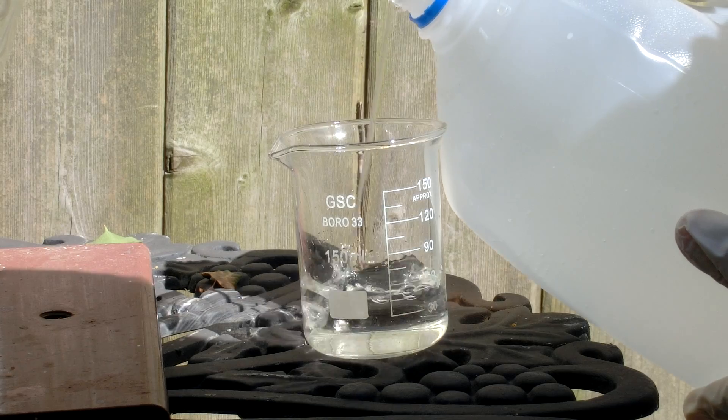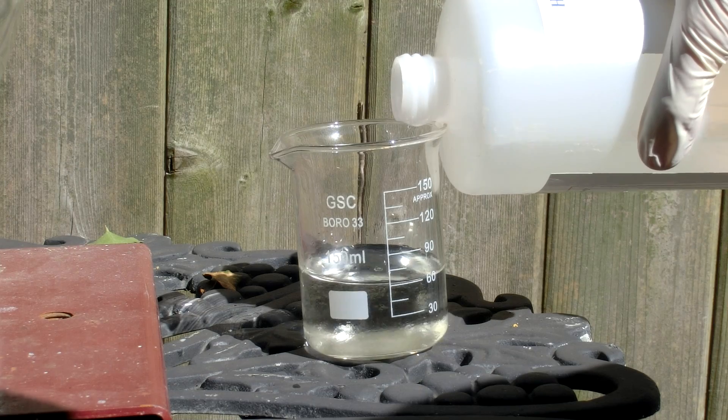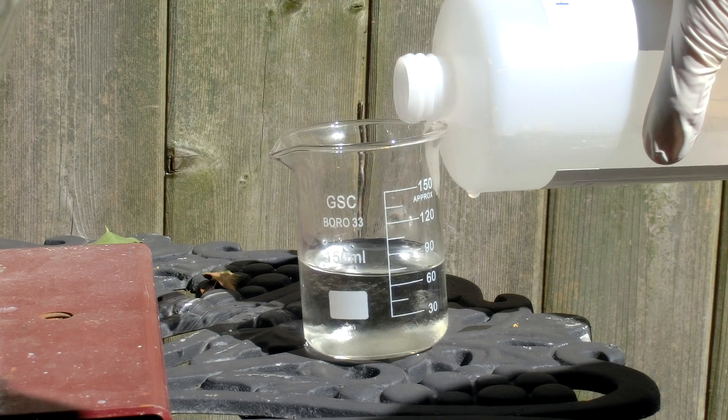Start by measuring out 60 milliliters of water. Then slowly add 60 milliliters of concentrated hydrochloric acid to this.